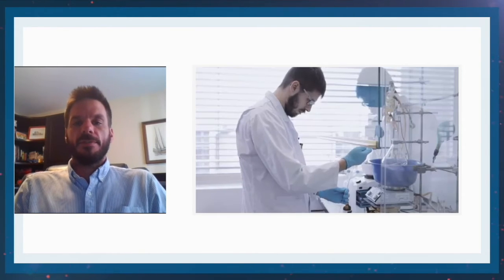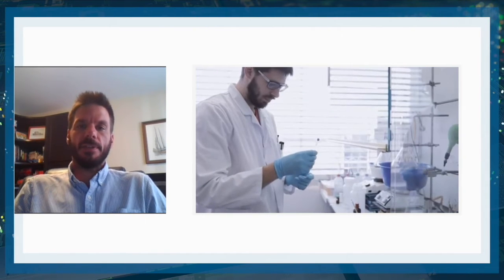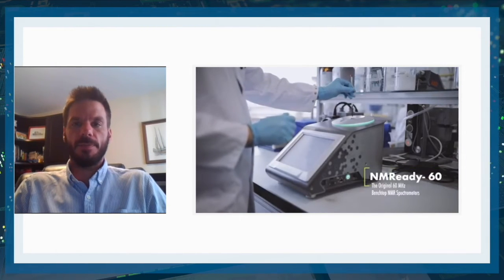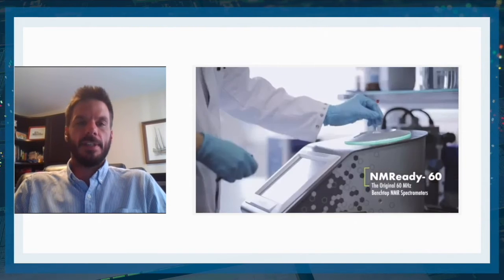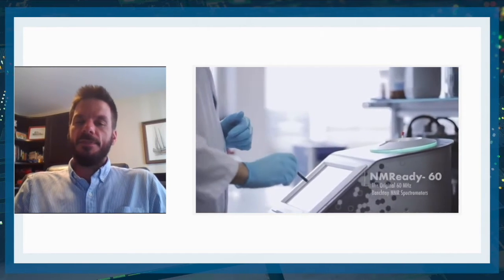And right now, the market for nuclear magnetic resonance spectrometers sits around $1 billion globally. Most of that market right now is made up of high field, large machines. These machines, as you're about to hear, are the size of a room. They have to have a professional operator. They have to be cooled with liquid nitrogen, and they're very difficult, very sensitive machines.